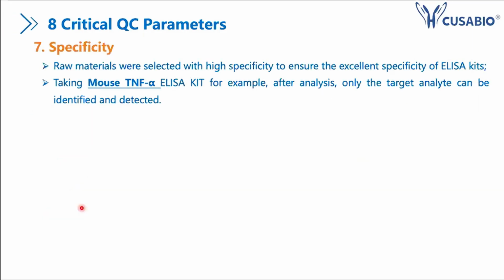The next one is specificity. Specificity, to be clear, is to make sure that the kit will specifically detect the target without cross-reactivity with other closely related or similar molecules.